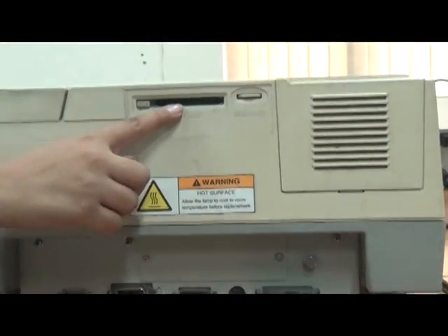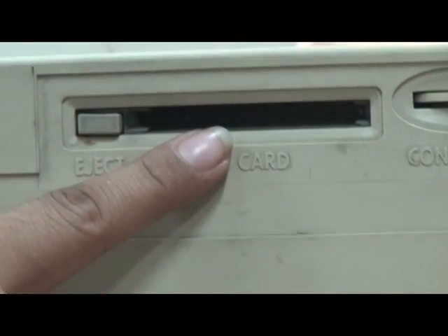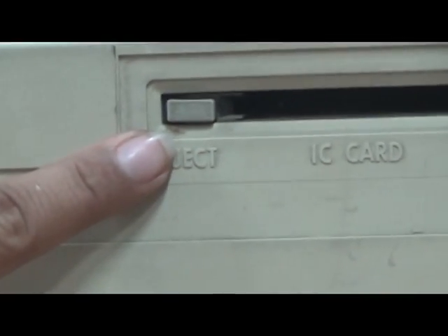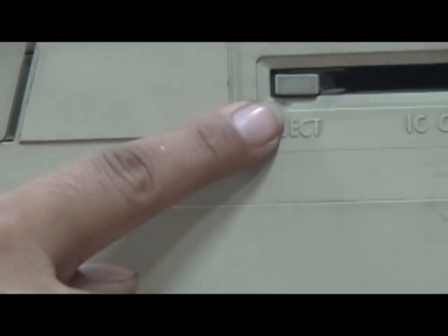This is called the IC card slot. This is the slot for inserting an optional IC card, that is data pack or program pack. This is called the eject button. This is the button to press for pulling out an inserted IC card.